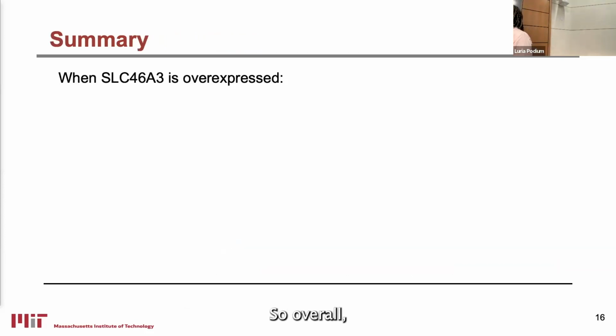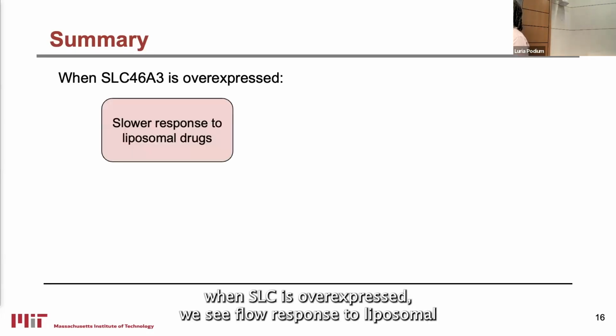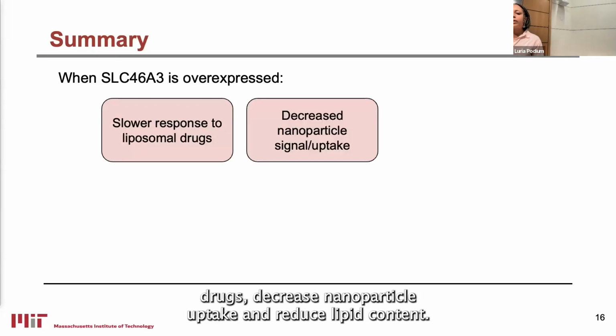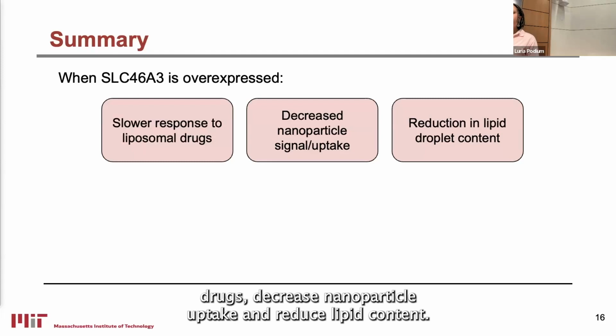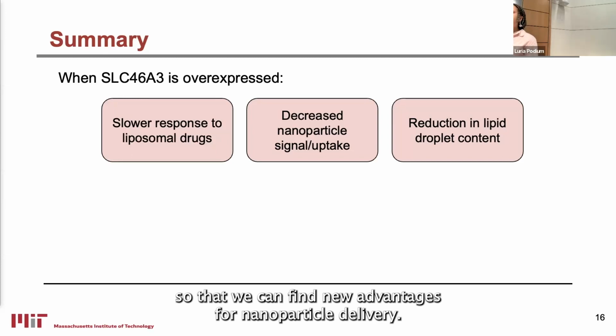So overall, the things that we wanted to see for our project: when SLC is overexpressed, we see a slower response to liposomal drugs, decreased nanoparticle uptake, and reduced lipid content. This is all very significant in our lab when studying SLC, so that we can find new advantages for nanoparticle delivery.